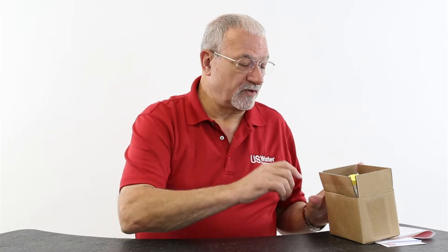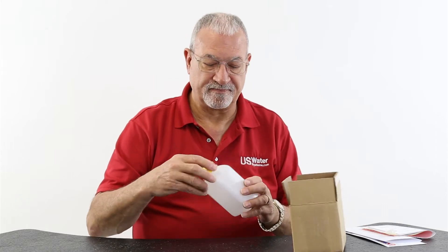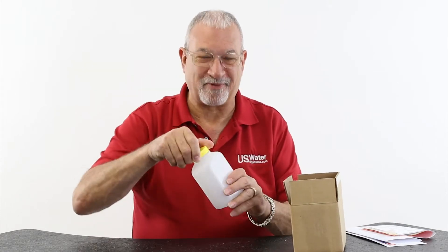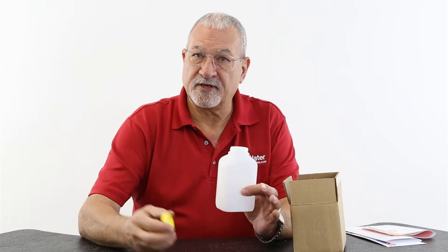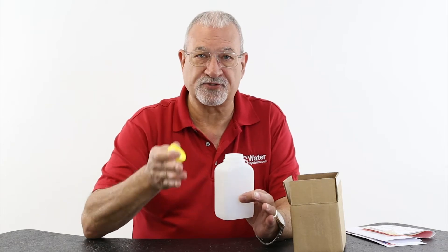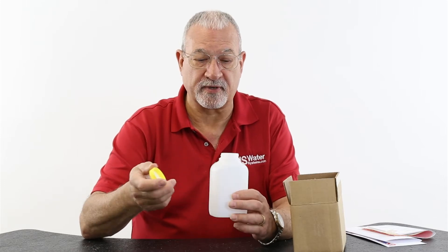Here's the way it works. You order the water test on our website and we ship it to you in a box like this. You'll get a bottle that looks a lot like this — in fact, this is the bottle. You want to run the water for about five minutes through no filters, no treatment devices, just your raw water, maybe from an outside hydrant or wherever you can find water that is not treated.